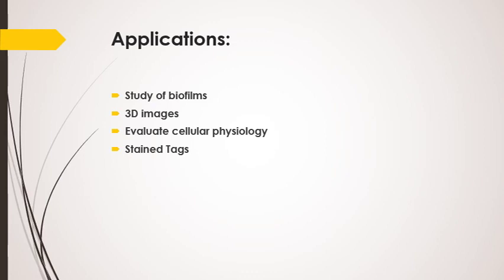In the end, it also enables us to study specimens that are first stained or tagged with a fluorescent dye, using certain fluorescent tags that bind specifically to a given protein or other compounds. So the precise cellular location of that compound can be determined. In some cases, multiple different tags that bind to specific molecules are used, each having a distinct color.